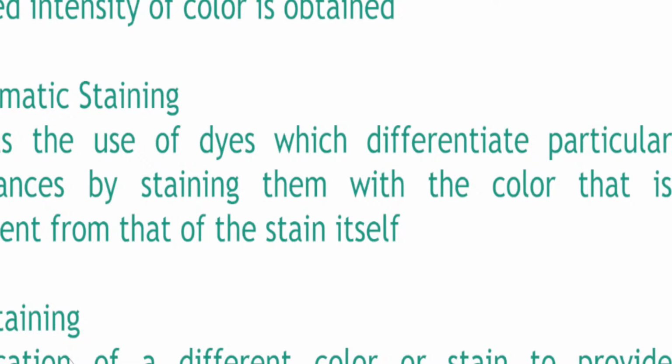Okay, we have counterstaining also, which is a type of indirect staining procedure, right? What is counterstaining? What is a great example of counterstaining? Gram stain. What's the counterstain that we use there? Safranin, right? So again, some of these terms can be interchangeable, but what I want you guys to know is the definition: application of a different color or stain to provide a contrast to a background. Okay, so what's the background?